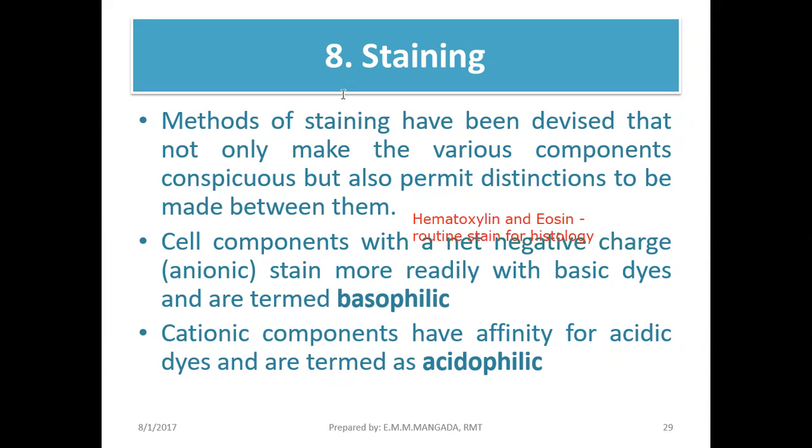Your hematoxylin stains now yung ating nucleus, and the eosin stains the cytoplasm. So guys, in your H&E technique, or staining technique, ano yung result natin? Okay? Guys, yung ating nucleus, it's usually dark blue or blue-black. Okay? Yung kanyang kulay. Sorry. Dark blue or blue-black. And the cytoplasm is pale pink. Okay?